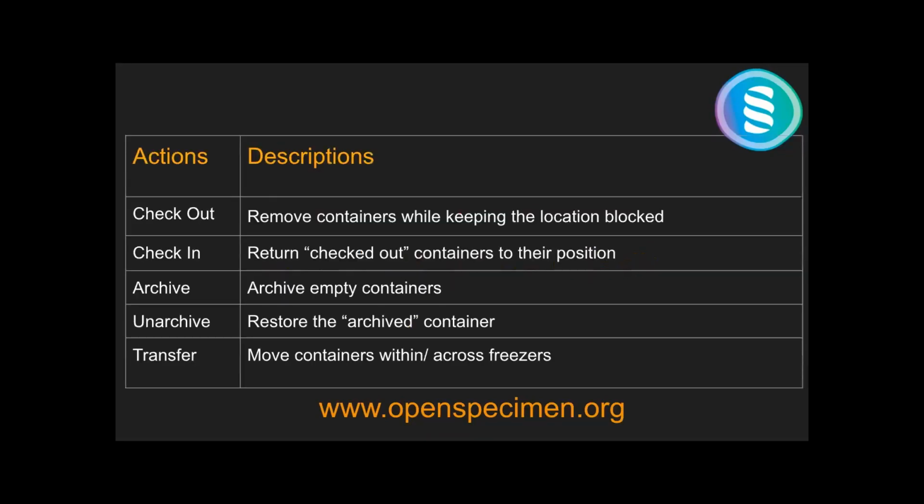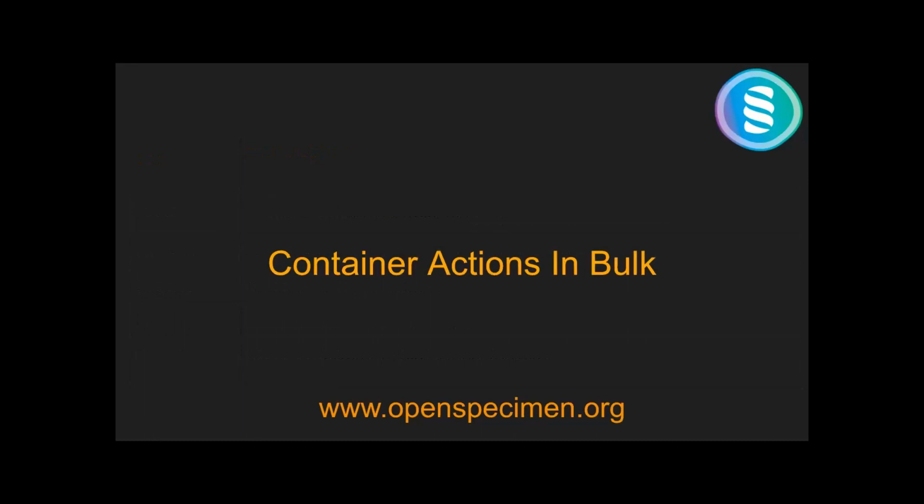So the next part is container actions in bulk. These are a few new features coming with OpenSpecimen.